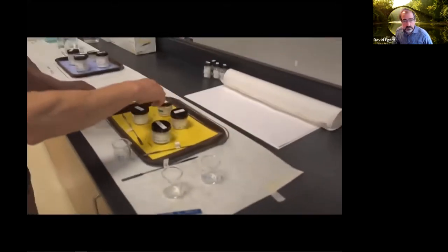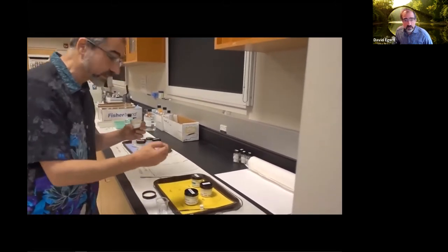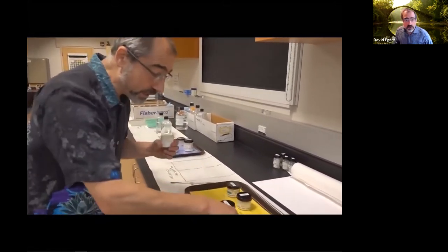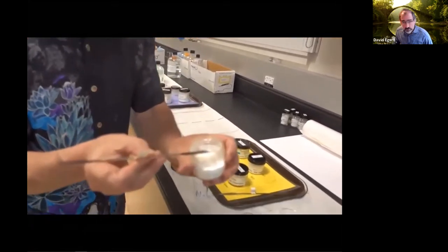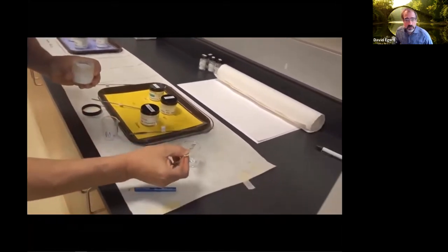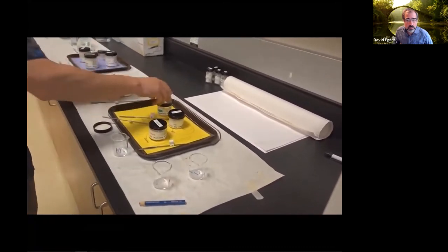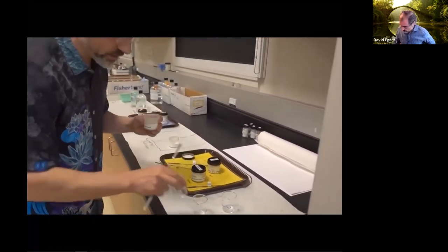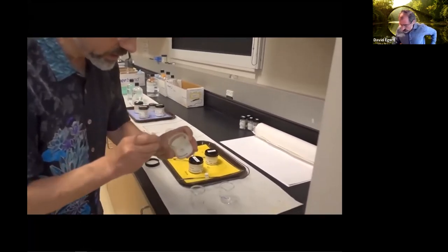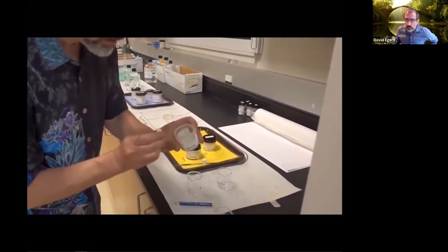So I'm going to put all of these in, and then our camera will come and look at this more closely. I've got my calcium chloride, again a little pinch, and I'm going to put that in that one. And I'm going to get my sodium chloride and put that in here.